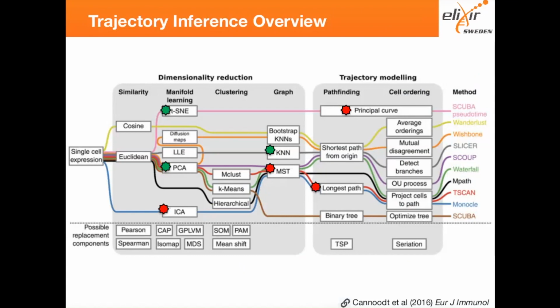So here's also just a nice overview of different methods. Overall, many of those things we have already talked about. We have seen about tSNE, PCA. This is also not updated. For example, we don't have UMAP. There are many other things that are not listed in here. But it's a good overview. So for example, different trajectory pipelines or workflows use different methods.